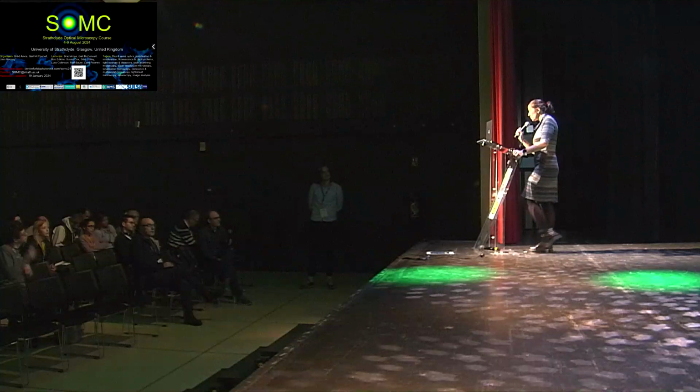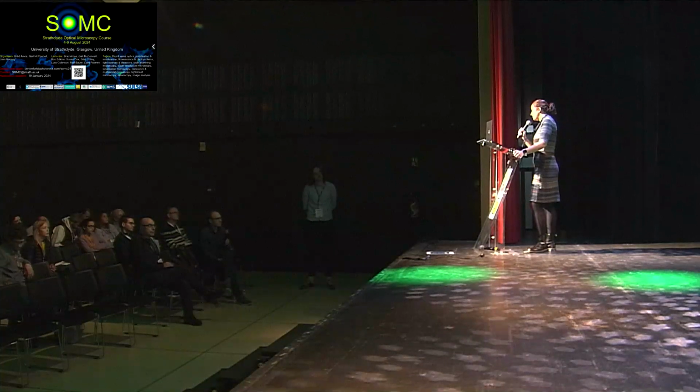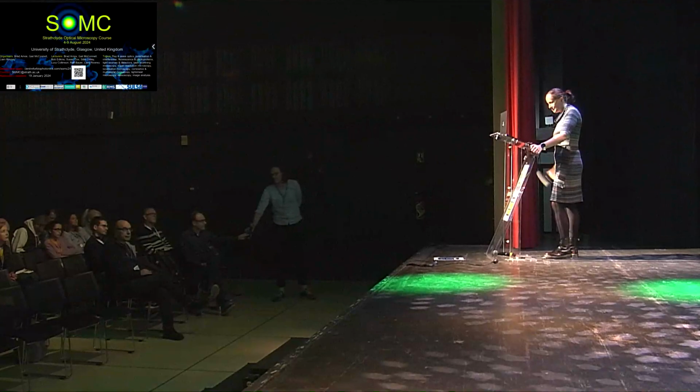So the working distance of the lens is 3 millimeters. And you're right about expansion microscopy. We're now working on it. Okay. Thanks. Thank you.